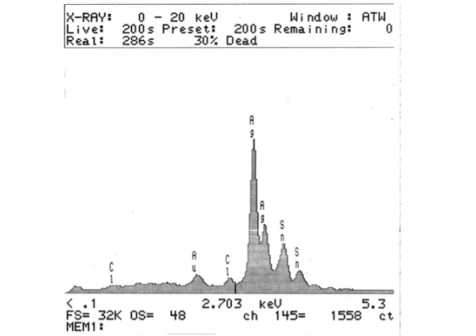Now, if we do this over all energies and count up the number of photons, we can produce a picture like this one that shows characteristic peaks. Part of my research program involves looking at lead-free solder alloys that contain silver and tin. And here you can see a peak that we have labeled silver and peaks that we've labeled tin and a small peak that's labeled gold.